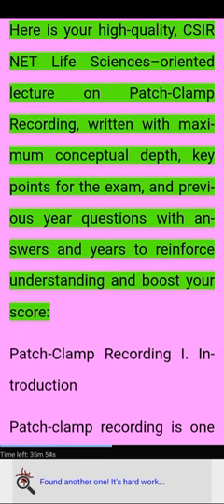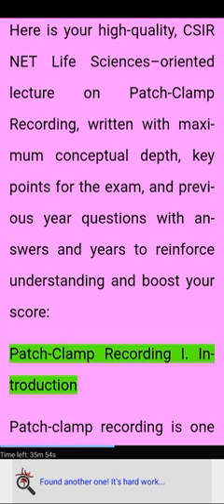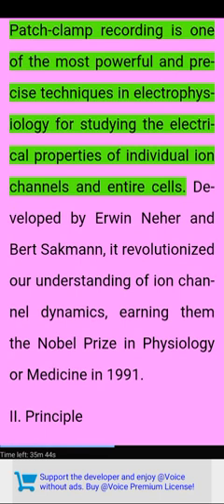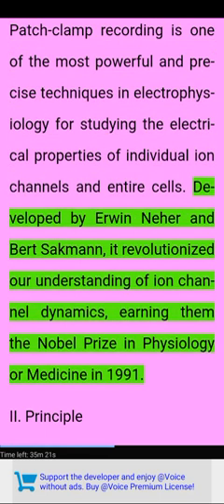Here is your high-quality, CSIR-NET life sciences-oriented lecture on patch clamp recording. Introduction. Patch clamp recording is one of the most powerful and precise techniques in electrophysiology for studying the electrical properties of individual ion channels and entire cells. Developed by Erwin Neher and Bert Sakmann, it revolutionized our understanding of ion channel dynamics, earning them the Nobel Prize in Physiology or Medicine in 1991.